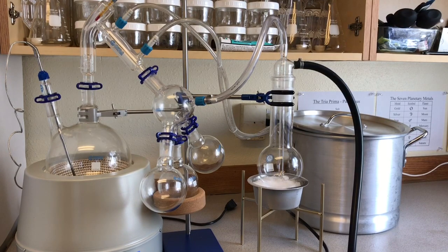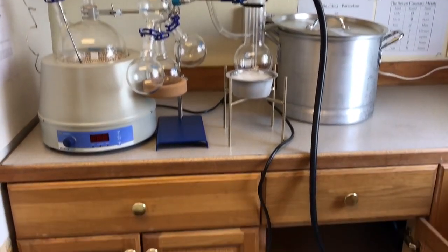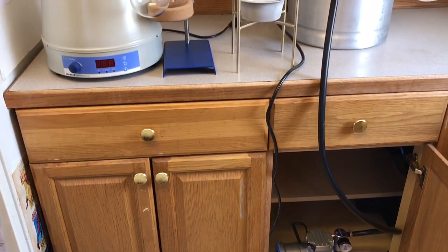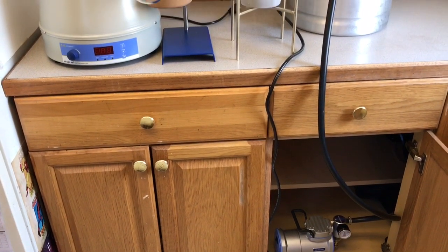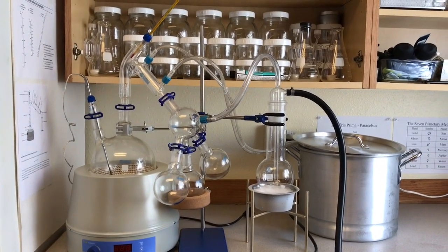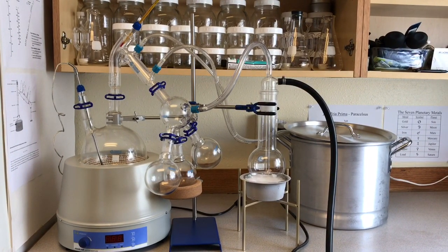And that will allow any moisture to condense within the cold trap, and that will keep us from damaging our pump. And you can see that the line coming off of the cold trap is going to go to our pump, and so I'll show you where our pump is. It's down here in our cupboard. This is for a couple reasons. The first reason is to kind of keep it quiet a little bit, and the second reason is if God forbid it were to explode, it would not hurt me or my distillation set. So we keep that in the cupboard with the door just a crack open, and that's where our vacuum pump is. I'm using a Rocker vacuum pump, a single stage 250.